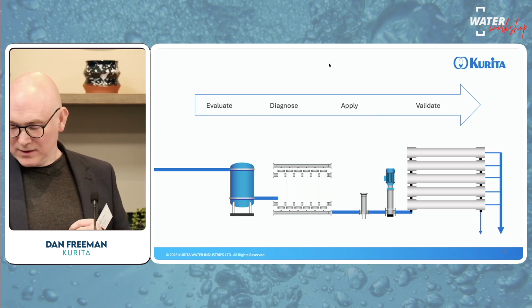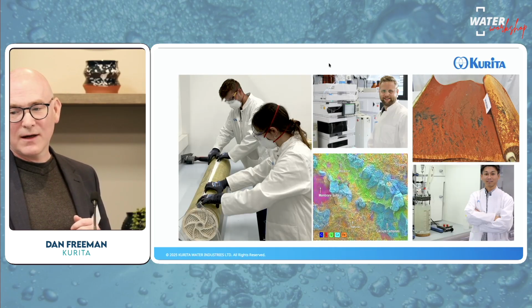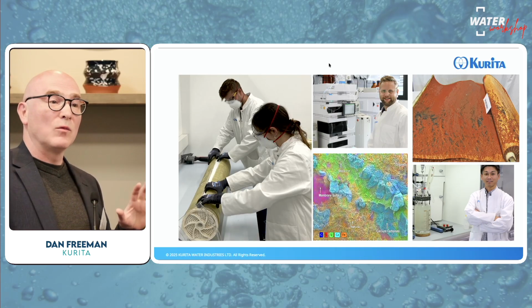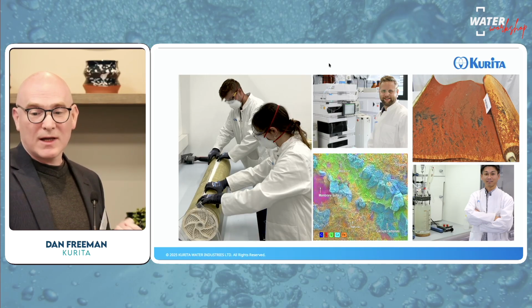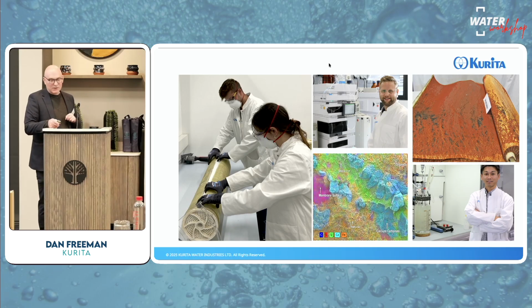And what I'm going to do today is talk about one of the tools we have in our locker for understanding what issues an operator may have with their particular system. I'm going to talk about autopsies and how we use an autopsy in order to identify issues with the system and correct those issues. An autopsy is an approach where we take an element that's fouled or damaged in some way, we break it open, we take a look at the membrane surface.